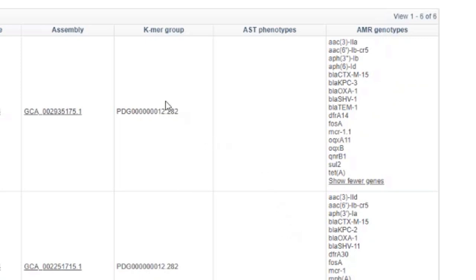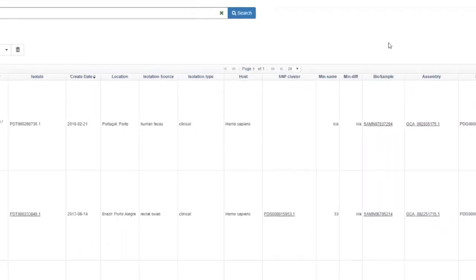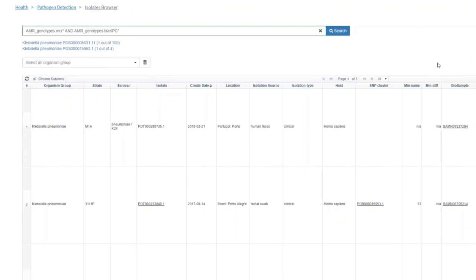You may ask: I'm not a public health lab — why is this useful to me? Not only can you get sets of isolates within antibiotic resistance, but we're planning to expand the genes available in this system to include virulence genes, metal resistance, and biocide resistance — expanding the tool to allow subsetting of the full dataset. With over 107,000 Salmonella, we hope this interface will allow more effective subsetting rather than doing a BLAST search across all 100,000 genomes, which would be time-consuming. We hope to make these types of large-scale interfaces more effective across NCBI in general.